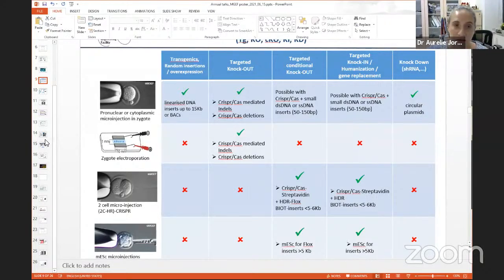So that the vasectomized males will not contribute to the sperm, but what happens in mice is for the pregnancy to occur, there needs to be physical mating. The hormonal stimulation is not enough. There needs to be physical mating for the female to initiate the proper hormone signals. And so for that, we use the vasectomized males.